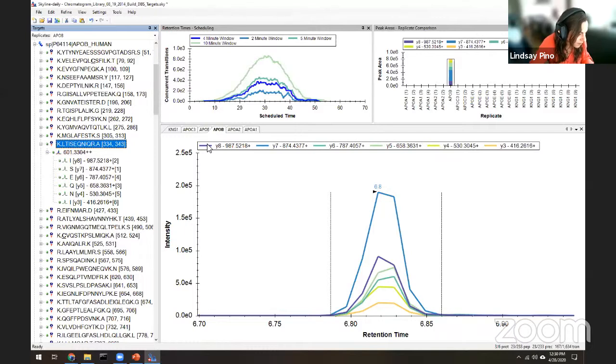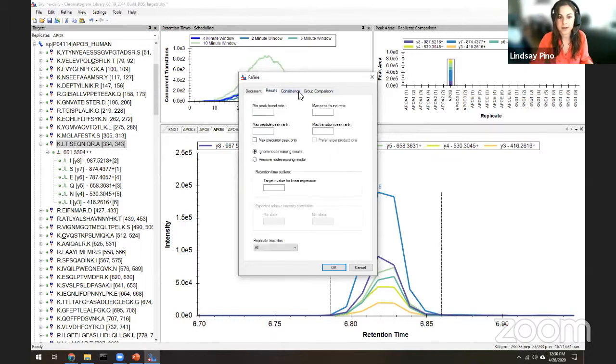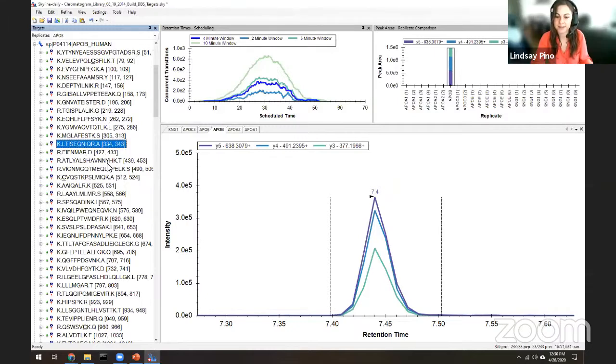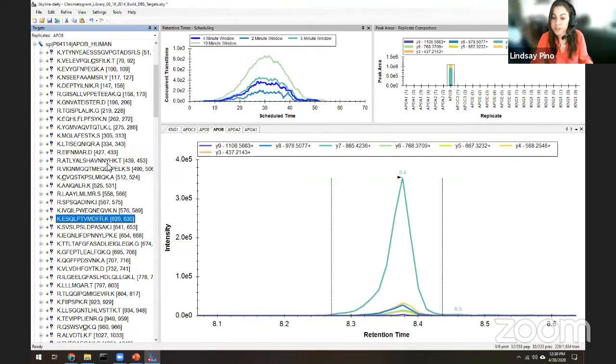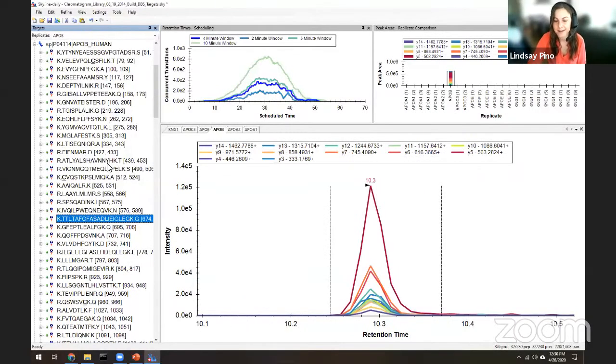Can Skyline make precursor selection automatically, like top 5 peptides? You can go to refine, advanced, and use some of these tabs in the advanced refinement. So you could do some refinements here based on peak ranks and pick the top ranked things instead of doing it manually. That said, Skyline can't tell you, it will just be intensity. So if there were things like peak shape, maybe this particular peptide has a poor peak shape, so I would remove these because they got shoulders.